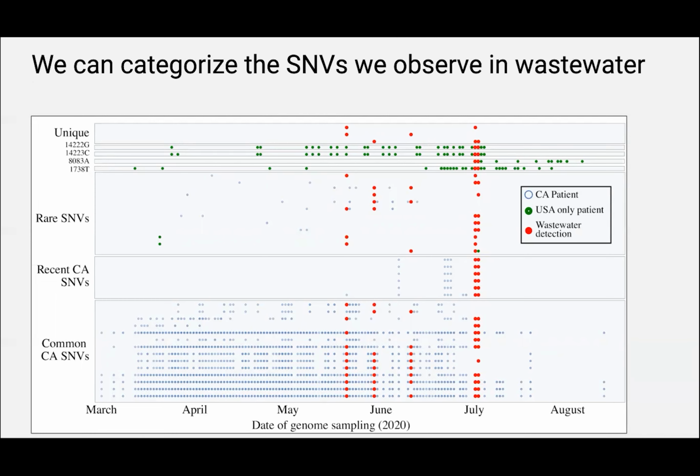Great. Then right above that, we can see this interesting collection of alleles that had only recently been detected in California, only later in the summer. We're actually midway through the summer at this point. And likewise, we only saw them in our later time points in the wastewater.